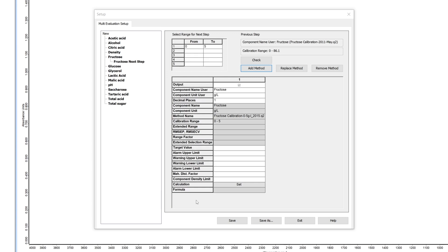In the table on the top, you select the range in which the MEV will perform the next step quantification. Per default, it is the range of the new method and you can only decrease your range.